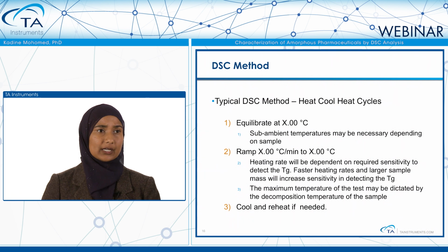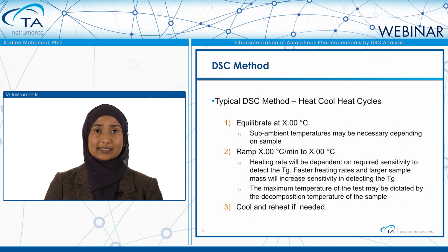The liquid nitrogen accessory allows you to start the test at minus 180 degrees Celsius, or if you have the refrigerated cooling systems, you can start as low as minus 90 degrees Celsius.